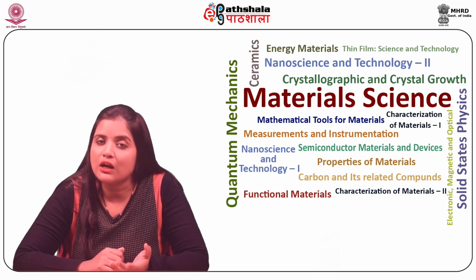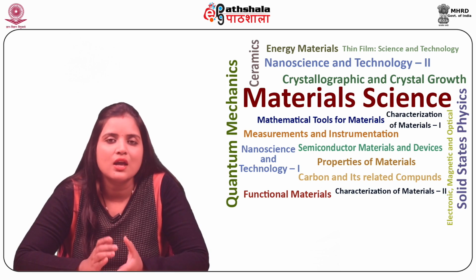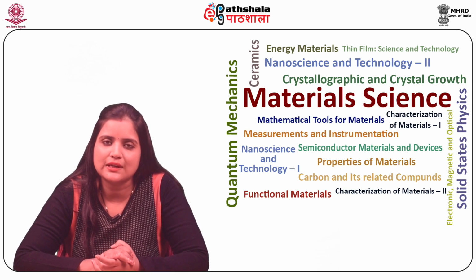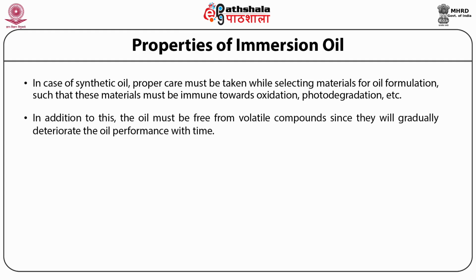This test is conducted to verify various properties of the oil such as acidity, solvency, etc. In case of synthetic oil, proper care must be taken while selecting materials for oil formulation, such that these materials must be immune towards oxidation, photodegradation, etc. In addition to this, the oil must be free from volatile compounds since they will gradually deteriorate the oil performance with time.